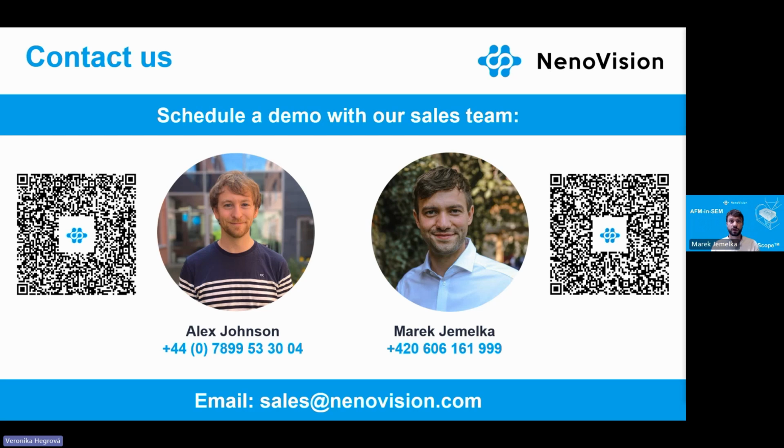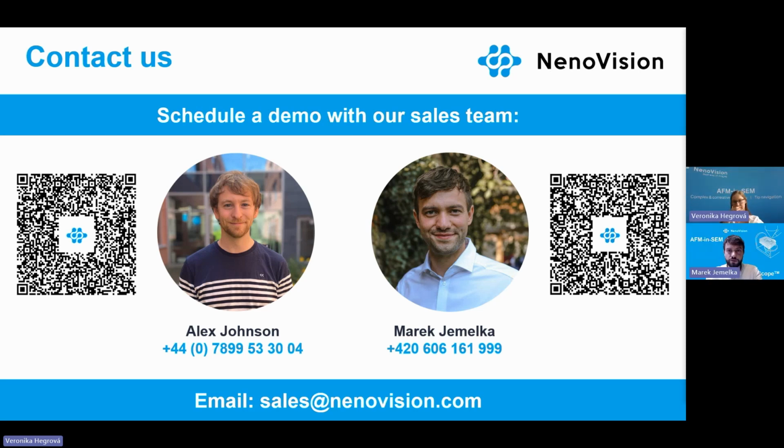Right, and I think it's now time for the Q&A session, Veronica, and there are actually plenty of questions there. I would like to start with this one from Jin. He's a bit worried and is asking how well the electrical characterization works for gallium focused ion beam, where the ion-induced layer removal will leave a lot of gallium atoms inside of the sample. Could you please answer that?